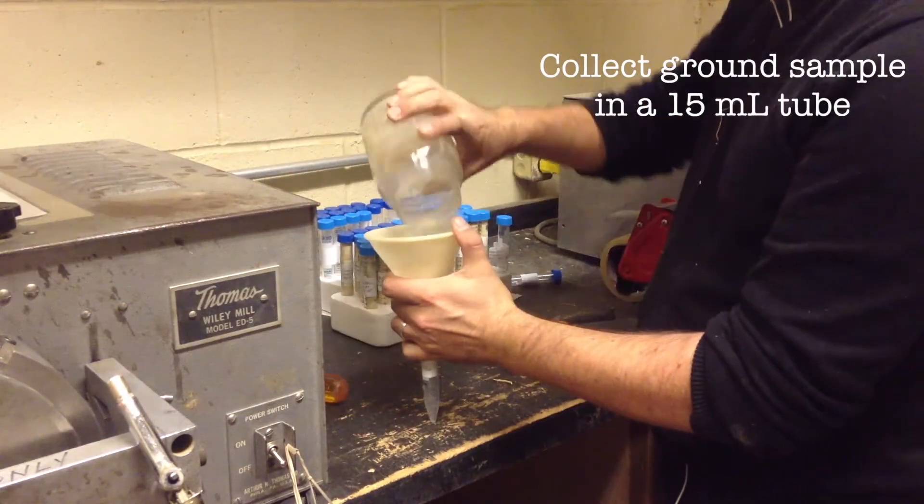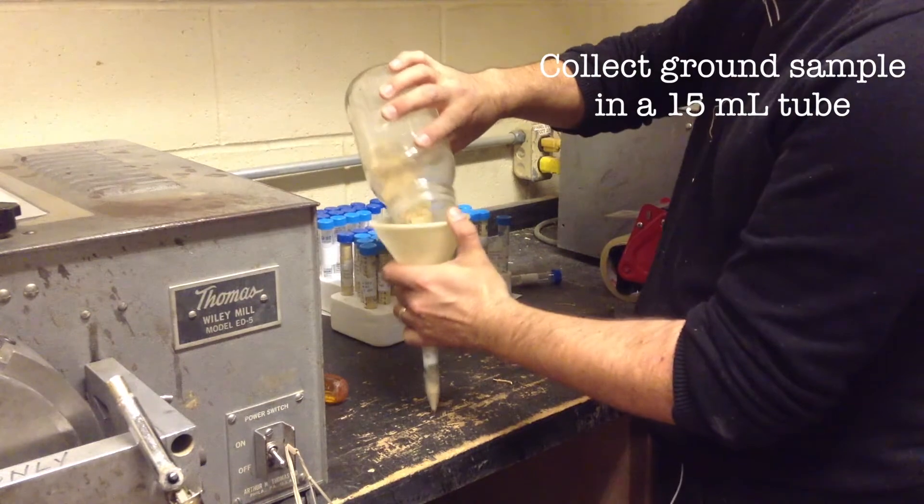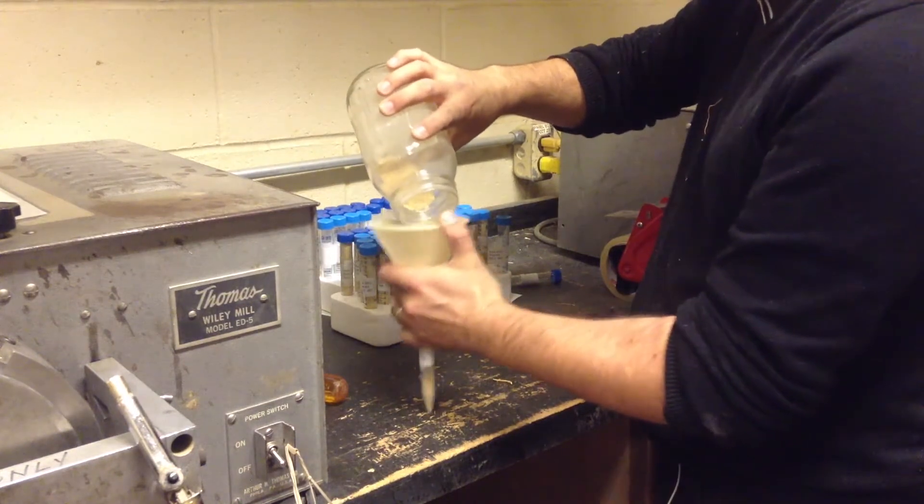After the sample is ground we will collect the material in a 15 milliliter tube which will be taken to the lab for further processing.